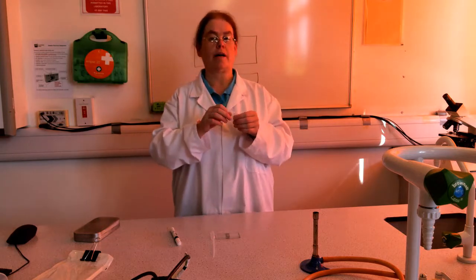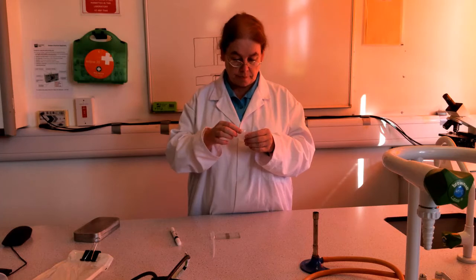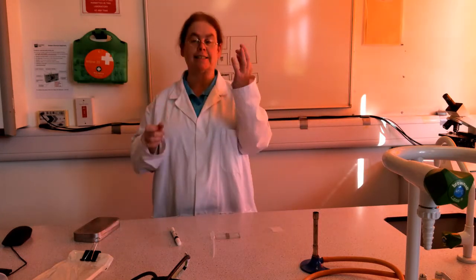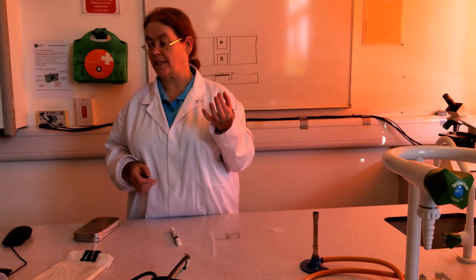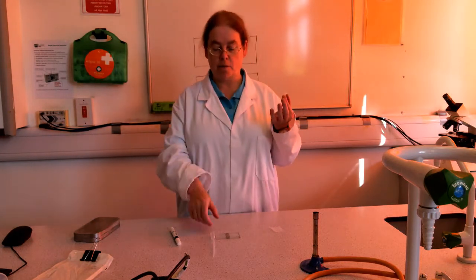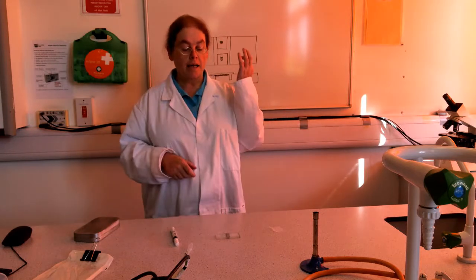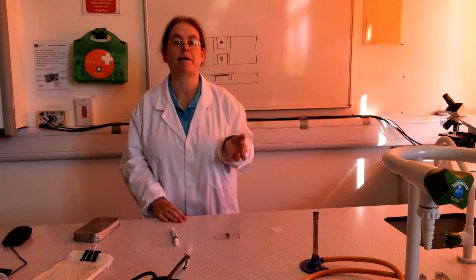Unlike a normal microscope, you have to use a special cover slip. It's still glass, it's still thin, but it's maybe not quite as thin as a normal cover slip. It's also very expensive, and if anyone breaks one, the lab techs will not like me much. So, unlike a normal microscope slide, you put the cover slip on before you put the specimen on.